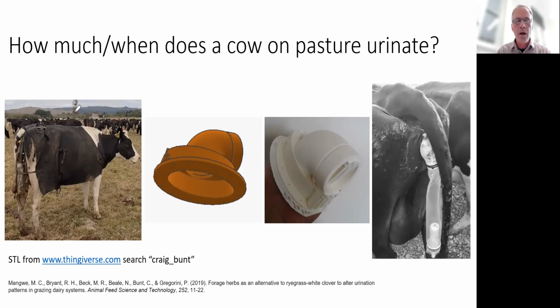So we went from a many kilos device, to this one here a few hundred grams, in a very short, quick process. If you're interested in things like this, you can actually find this design on Thingiverse and just search my name.